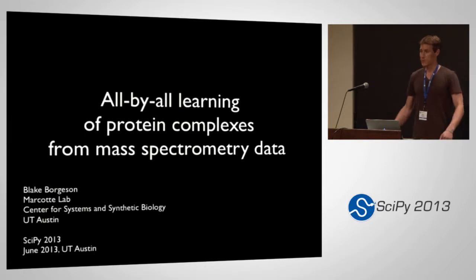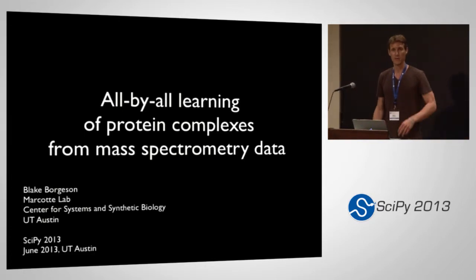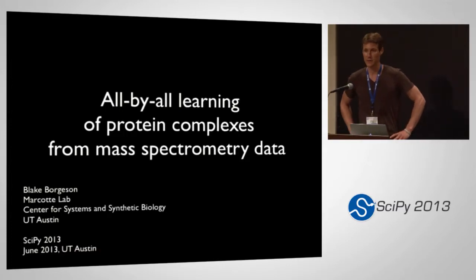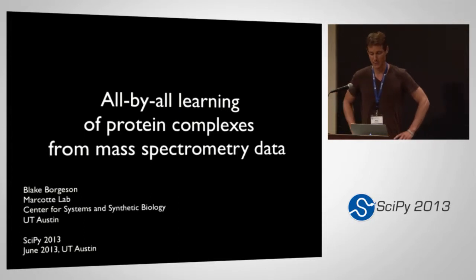But yeah, so I'm Blake Borgeson. I'm at the Marcotte Lab here at UT Austin. And I appreciate the organizers giving me a chance to speak. I'm going to tell you about a project that I've been doing here called all-by-all learning of protein complexes from mass spectrometry data. And hopefully, if it's not clear what that means, it'll become clear.